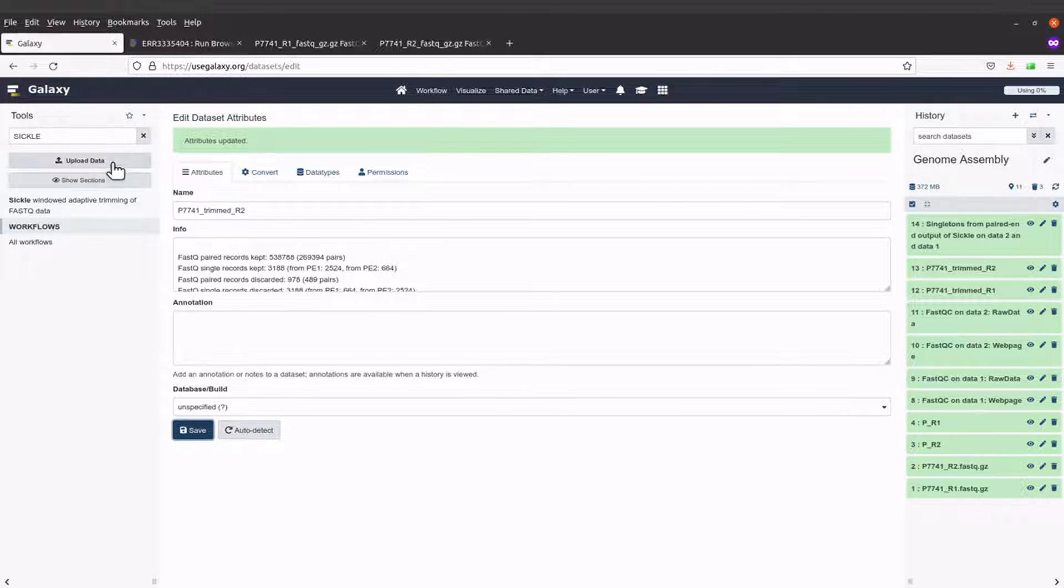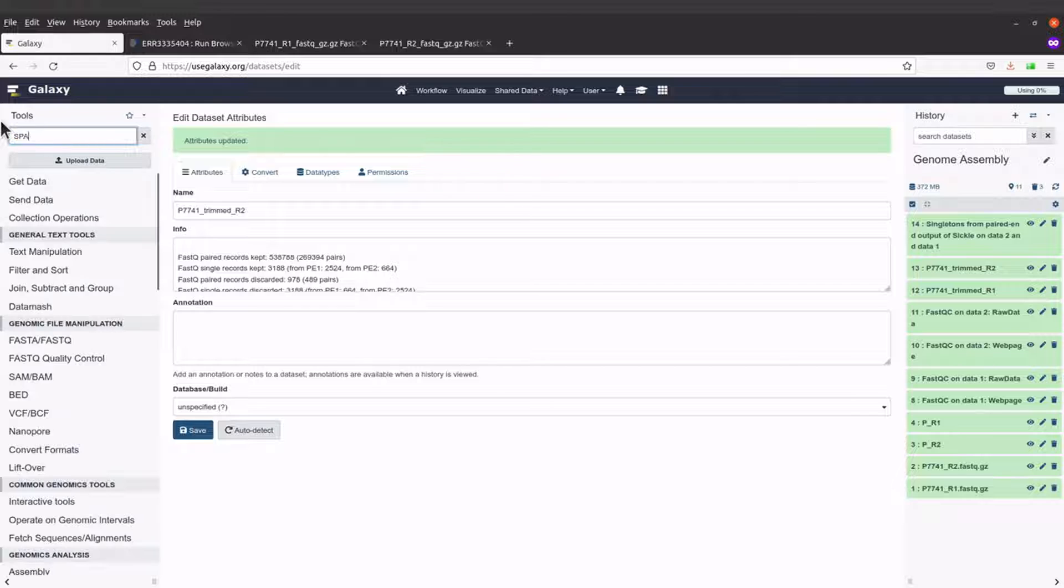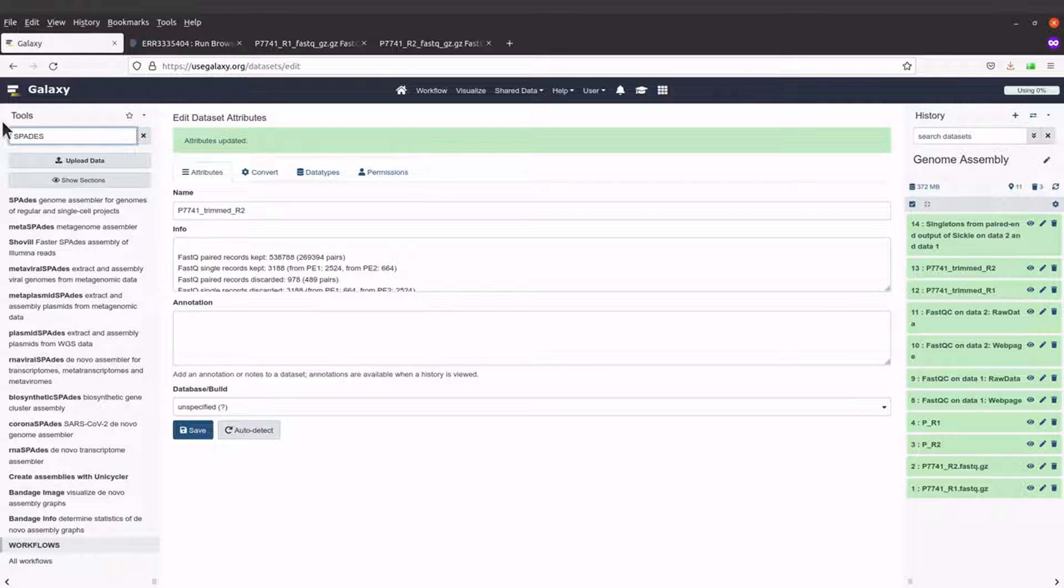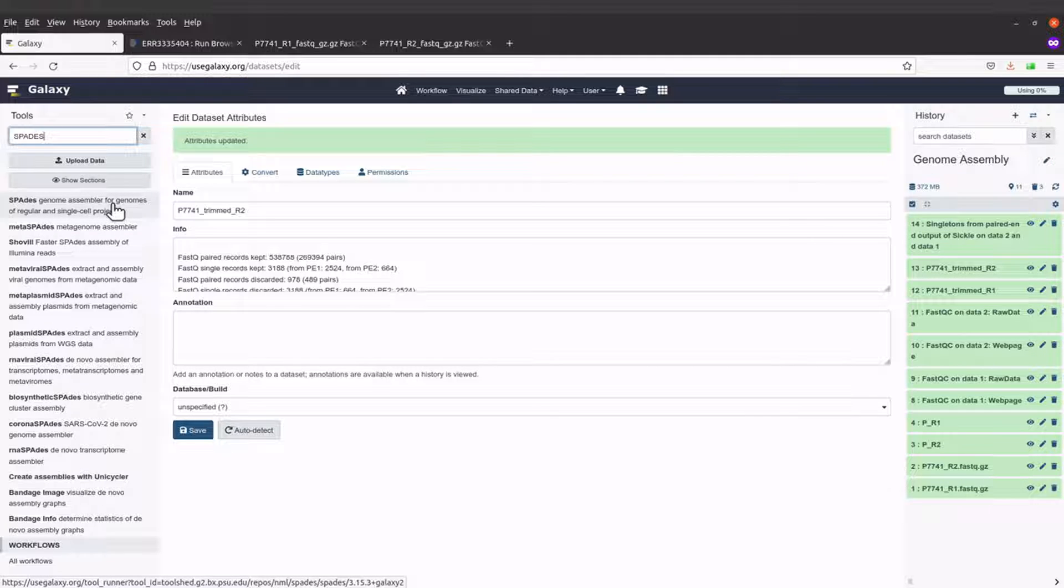Now I'll search for SPADES because it's time for genome assembly. I have SPADES genome assembler for genomes of regular and single cell projects, so that's what I'll select.